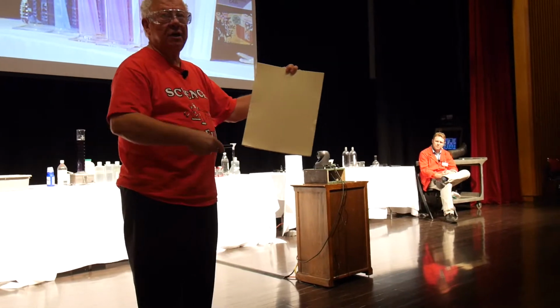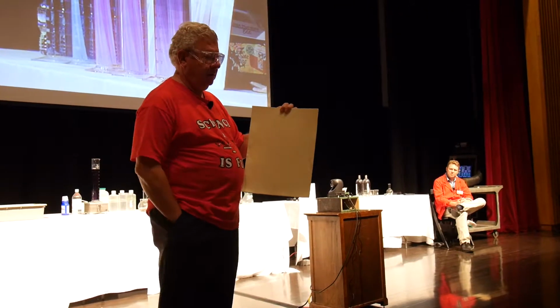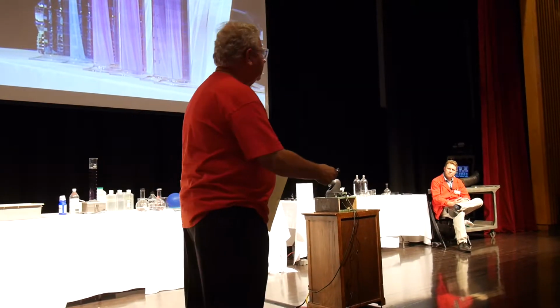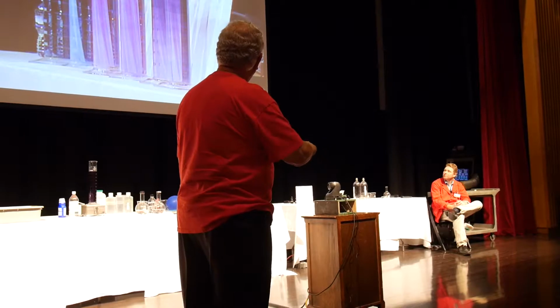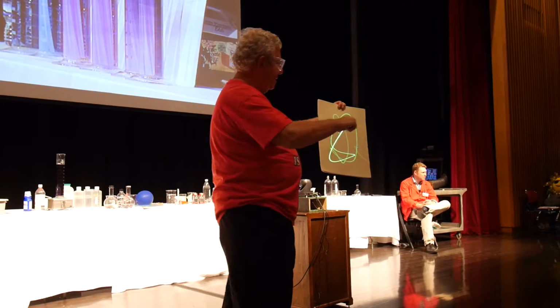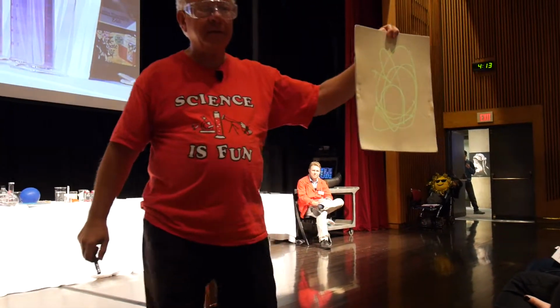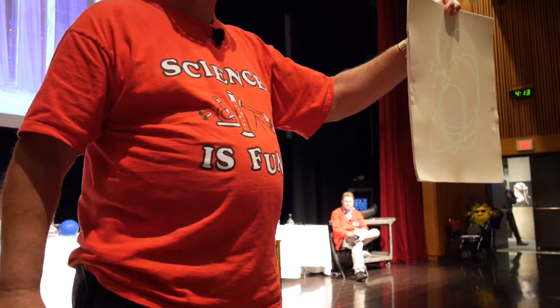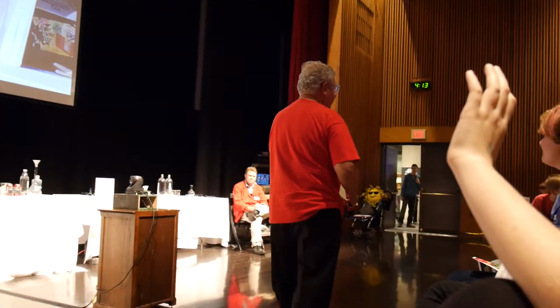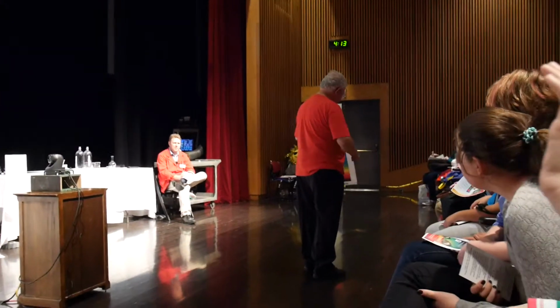All right. Now I'm going to switch the two that I have here. Where's the other one? There's the other one. Now, what color is this one? Can you see that one now? Oh, I have that. What happened? Ultraviolet. That's what we want to know. What happened? So this is a sheet of paper that is sensitive to light. And what I want to show you here, if I can.